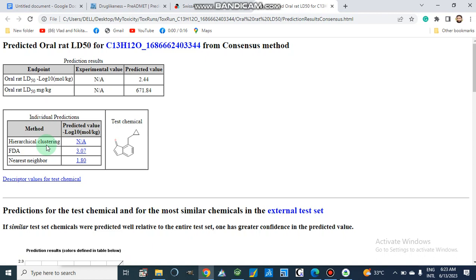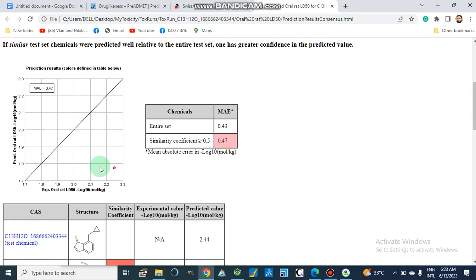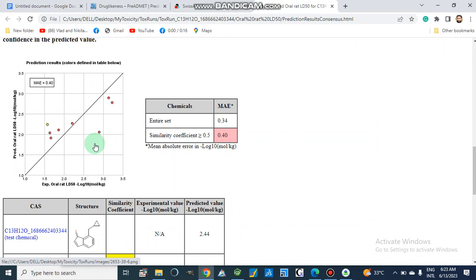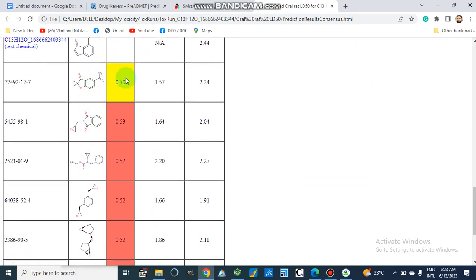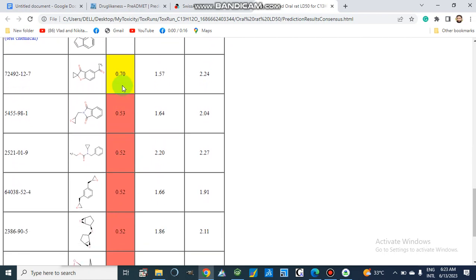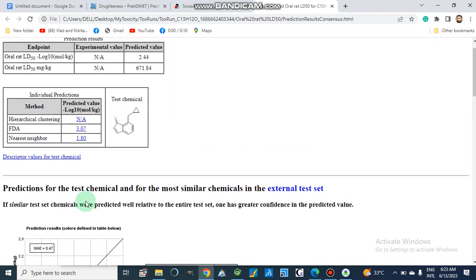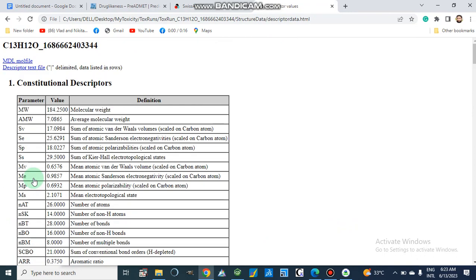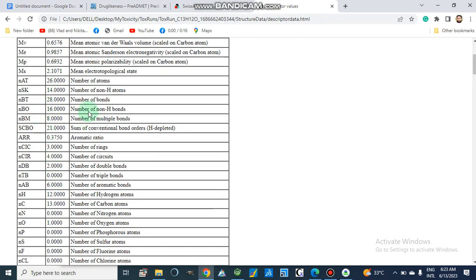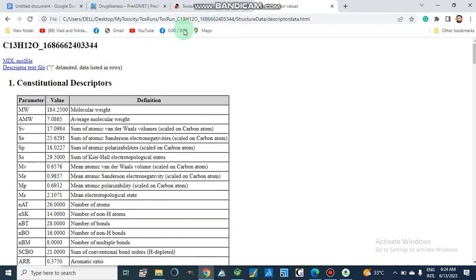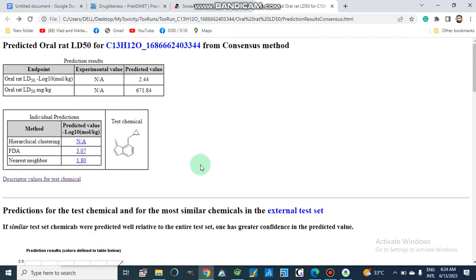From hierarchical clustering the value is 3.07, and from nearest neighbor it is 1.80. Here we can see our structure and its nearest neighbor, along with other nearest neighbors showing different similarity coefficients and their CAS numbers. We can also check descriptor values such as molecular weight, average molecular weight, number of double bonds, triple bonds, connectivity, and other values.